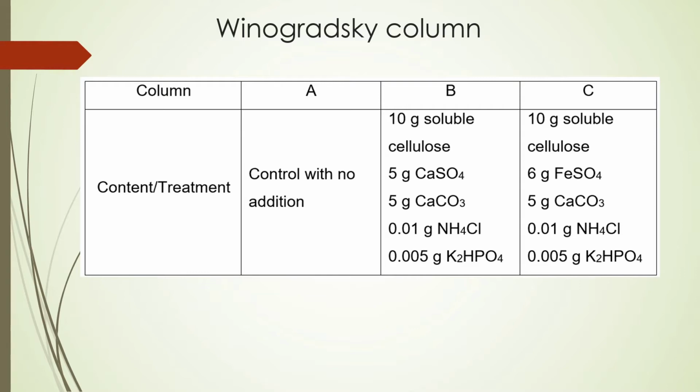The only difference between B and C is that in B we use calcium sulfate, whereas in C it is ferrous sulfate.